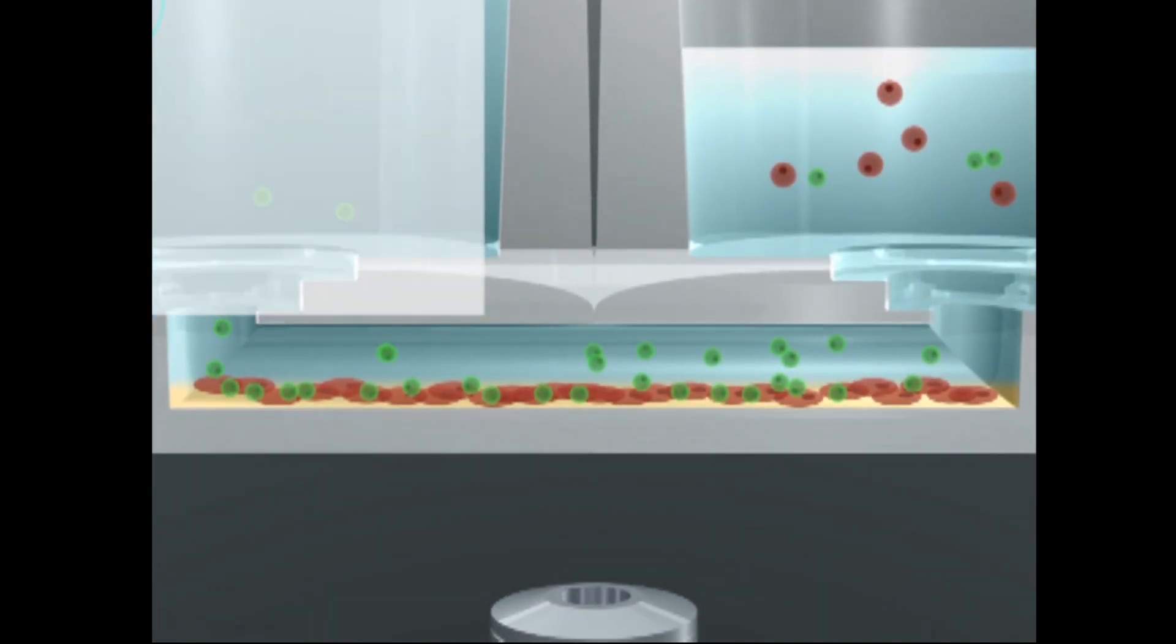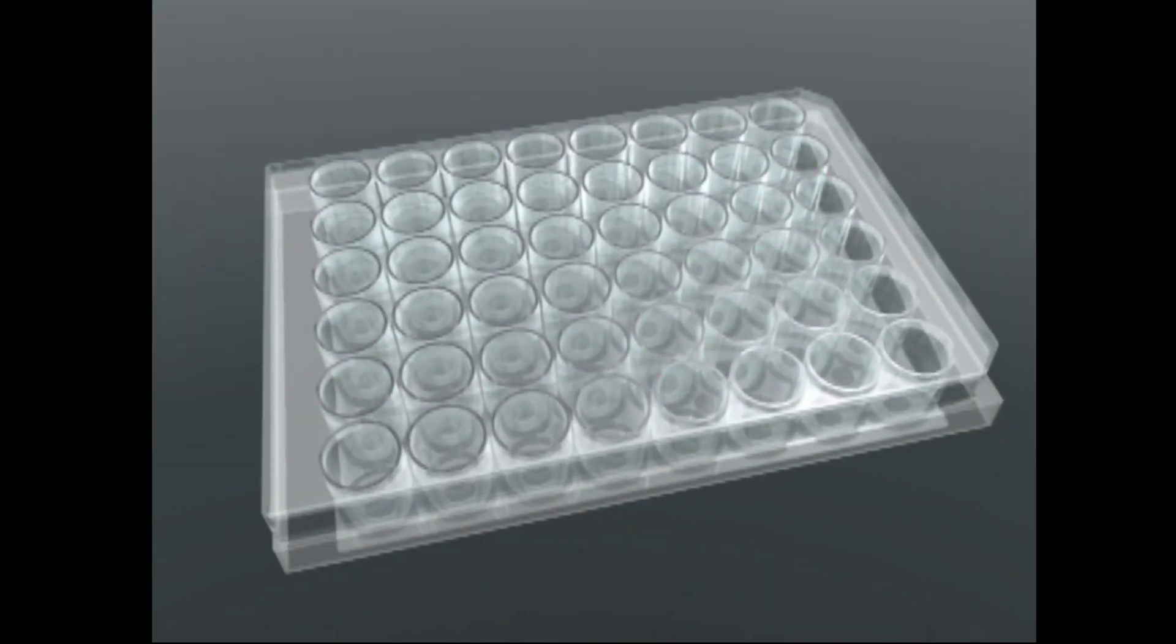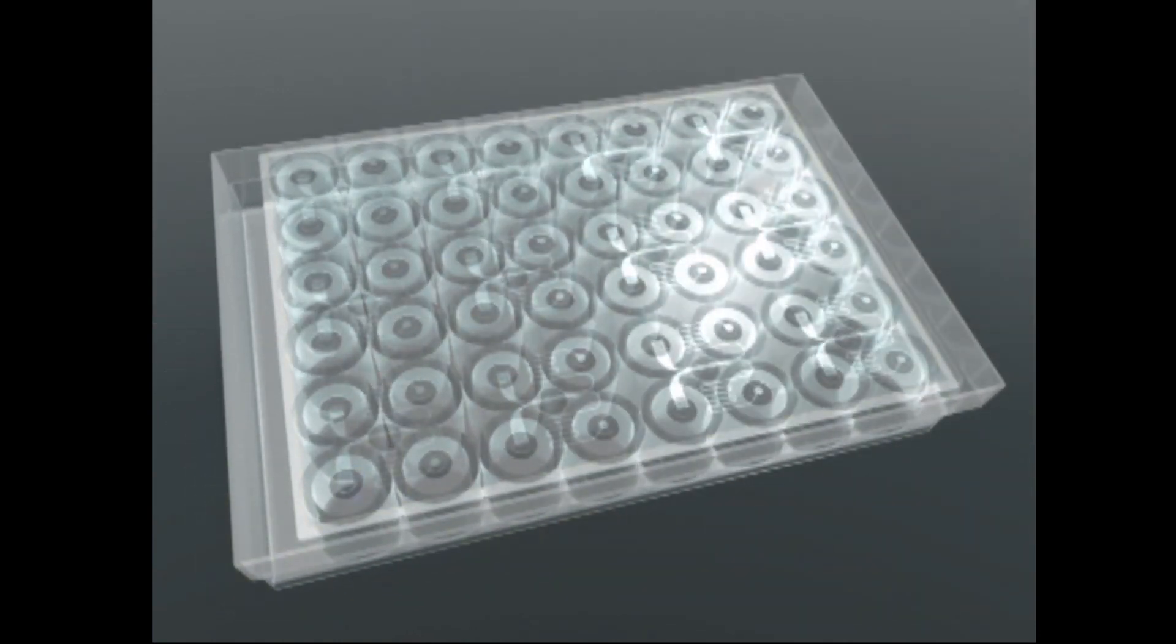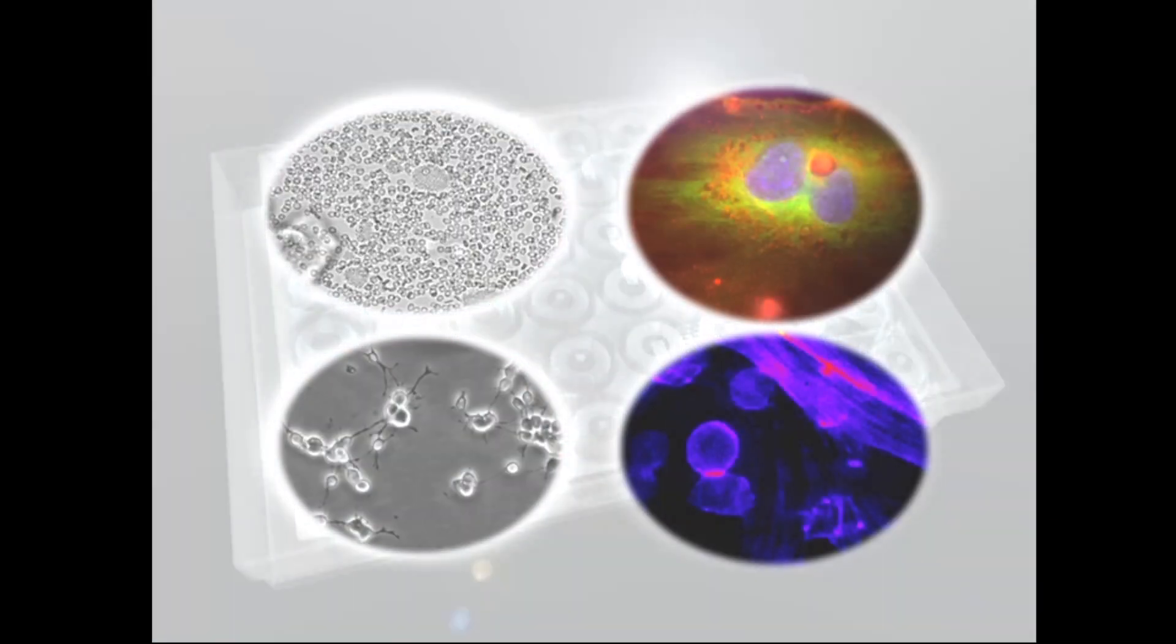Each experimental channel has a dedicated viewing area, which can be observed on an inverted microscope. BioFlux plates have 180 micrometer glass coverslip bottoms and are compatible with high-resolution microscopy. Images can be acquired in brightfield, phase, fluorescence, and confocal modalities.